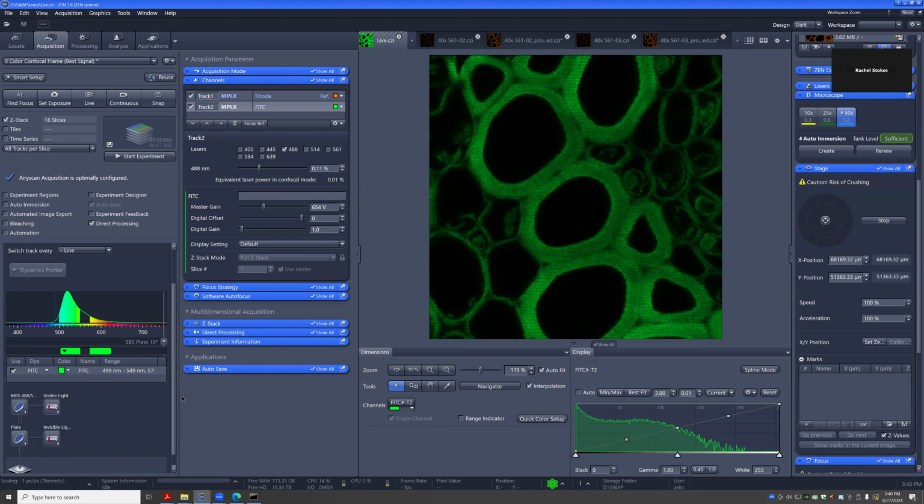Yeah, because it can let through both. It's always good to check. This comes through on both sides, so it's totally fine. So there are multiple combinations.